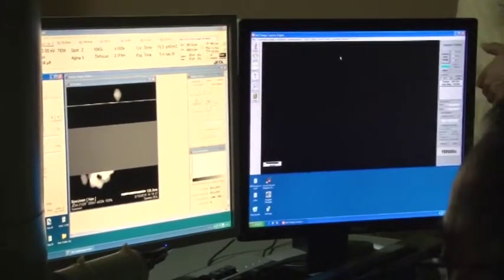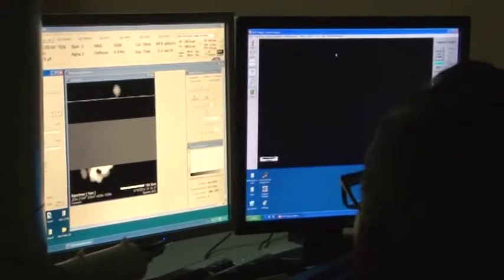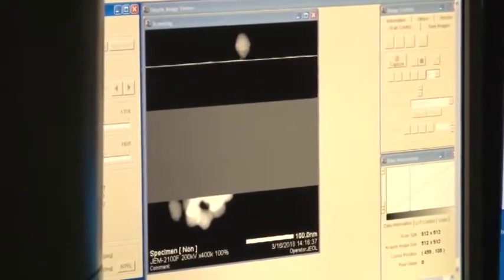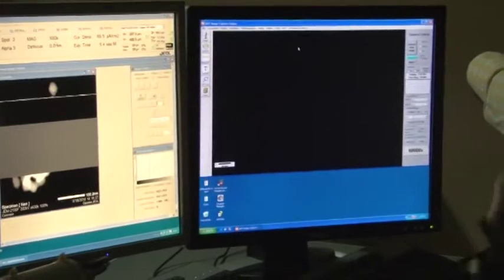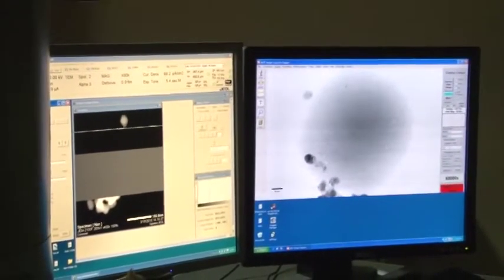I have reduced it to 100K. We can even go to maybe 60K. And I will still maybe, so that one can see it better, take it on the camera. Let us see. And now it is a very heavy exposure.